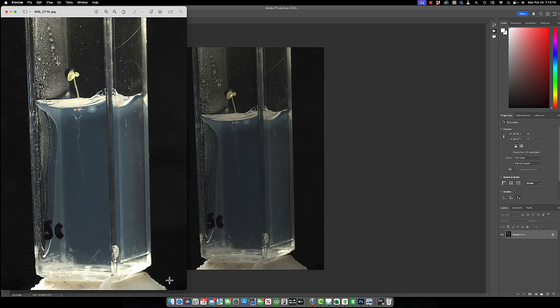I must have switched those stages. A lot was going on. It was a lot of work at the time, so something must have happened there, or the colors just wore off through time just from handling. But in either case, we'll still get through this.